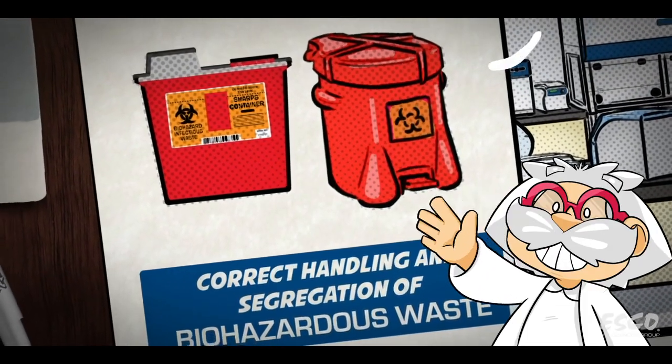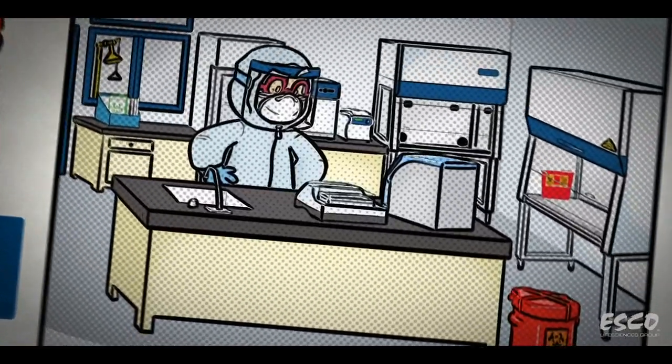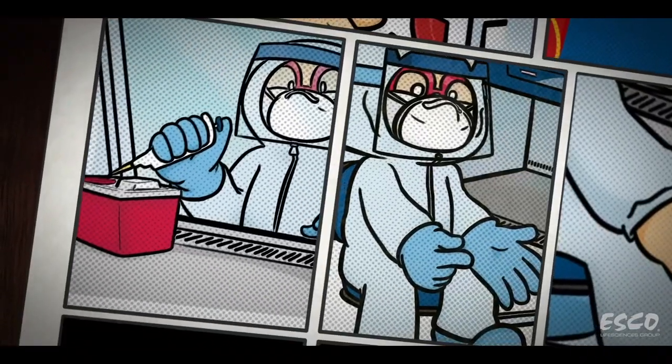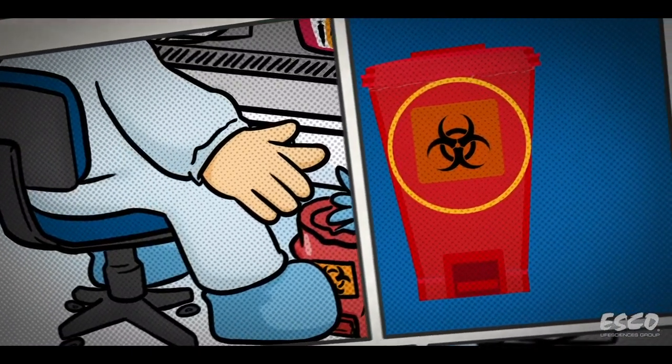Meet Dr. Inesco. He is currently working in the COVID-19 testing facility. After performing the laboratory procedure, he needs to dispose his used gloves and pipette tips. As responsible laboratory personnel, how should he deal with the wastes properly? Let us show you how.